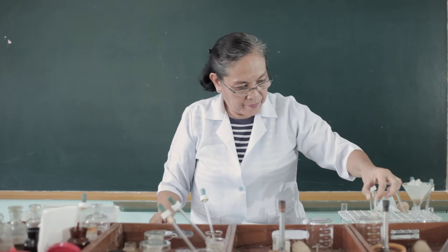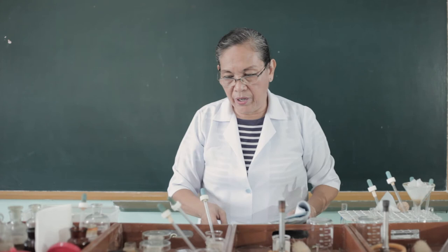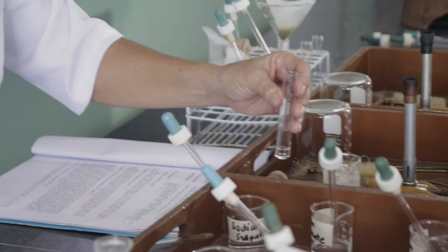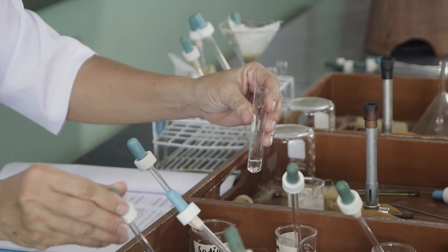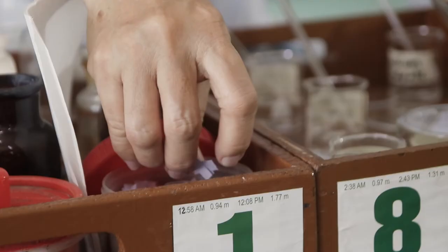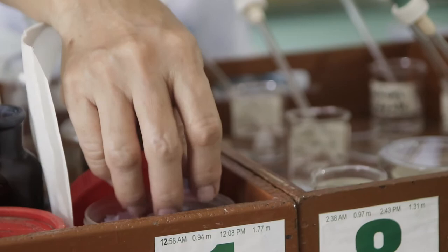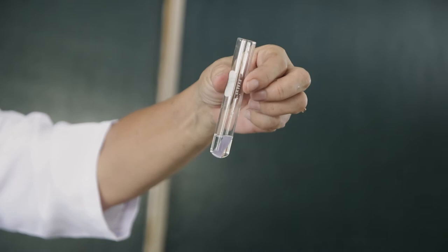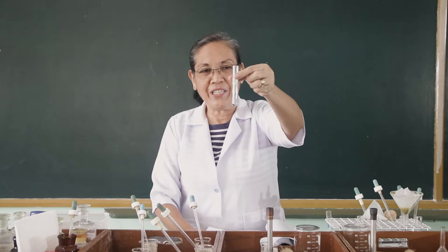Let's go to test for bromide and iodide. So bromide and iodide. Let's get a solution of sodium bromide and sodium iodide for our test sample. Take note that it is basic because the blue litmus paper remains blue. And let us neutralize this with the nitric acid.